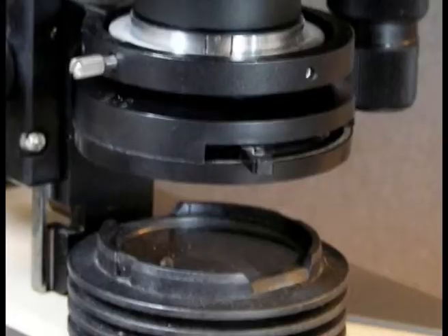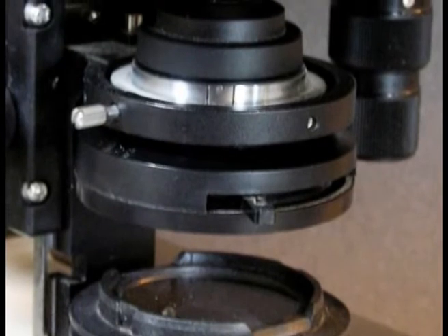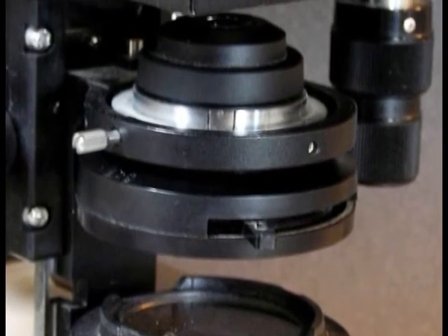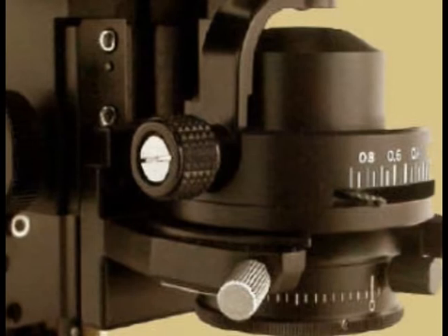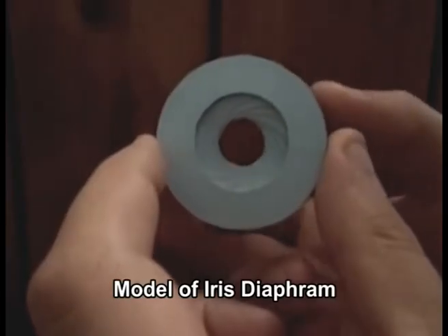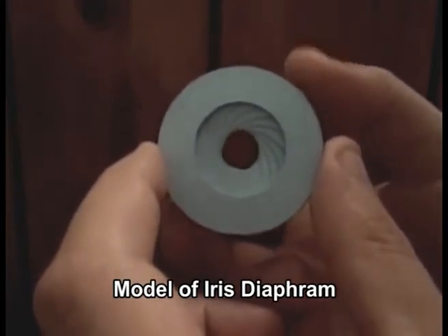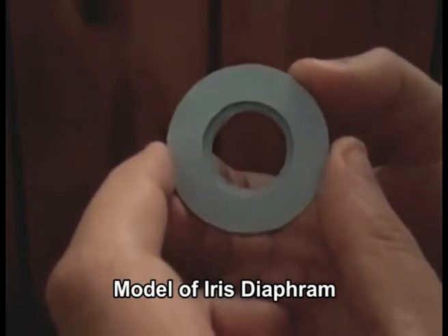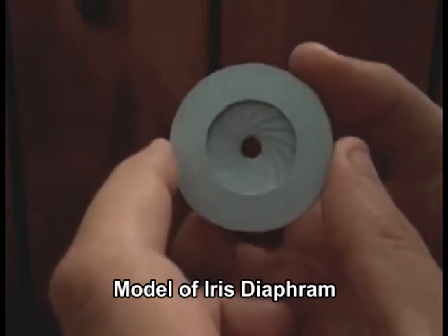The condenser consists of two simple lens elements and its function is to supply a cone of light just large enough to fill the front lens of the objective completely, giving maximum illumination. The iris diaphragm consists of a number of overlapping leaves or membranes attached by pins to the rim of a casing and having a central opening which is enlarged or diminished by moving a lever, and is placed above or below the polarizer.